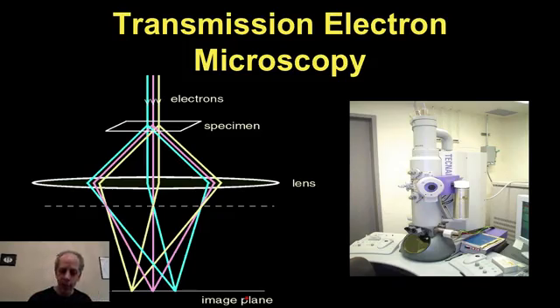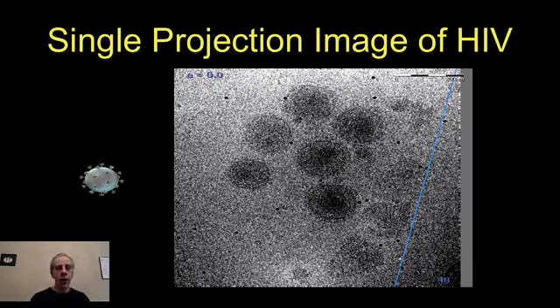So that's electron microscopy. And here is an image of what you will get from electron microscopy. Now remember, have always in mind, this is what we saw in the previous diagram. This is what we're looking for. One projection of that. So you took this electron microscope and you basically threw electrons and you have one projection of that, and that's basically what you have here. So this doesn't look very nice, but we're going to have to deal with that. And we're actually going to change the modality a little bit. But it's not that it doesn't look very nice because the instrument is not very good or the person that was taking the image is not very good at doing that.